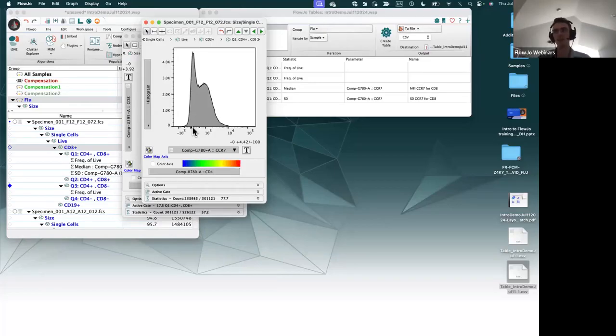It can spread into the positive or negative for multiple reasons. First of all, there's background subtraction that occurs on the cytometer, which tries to remove background noise from the equation. Sometimes the negative signal and the background noise look kind of similar and it doesn't really get picked up by the laser, so it'll have a value of zero or even less than zero if it was less than background noise, just due to the variance. So that's fine. Negative values are pretty normal. Compensation will also make values slightly negative sometimes.